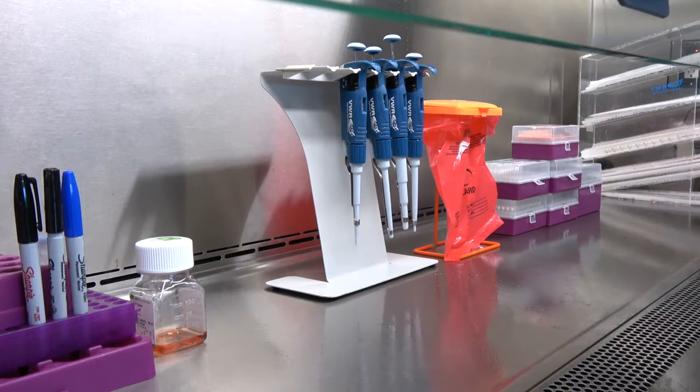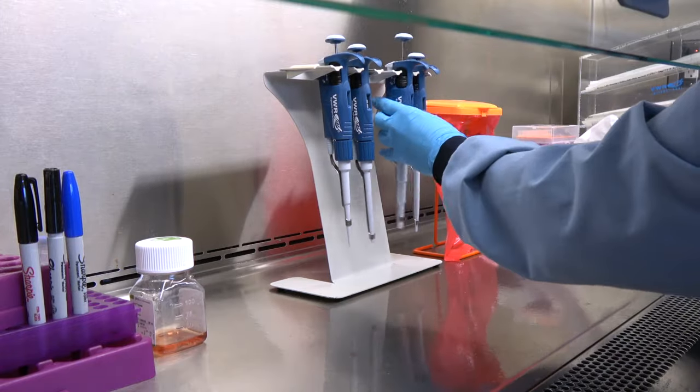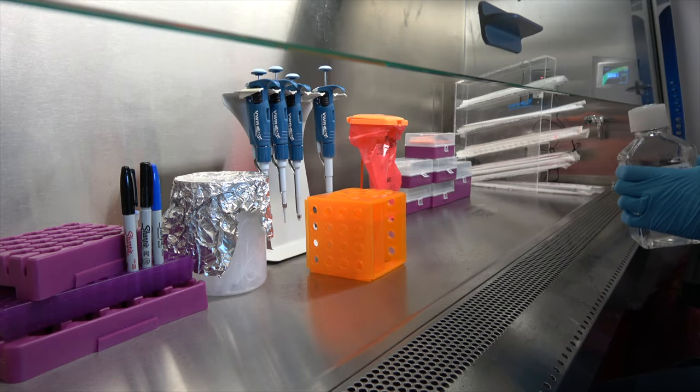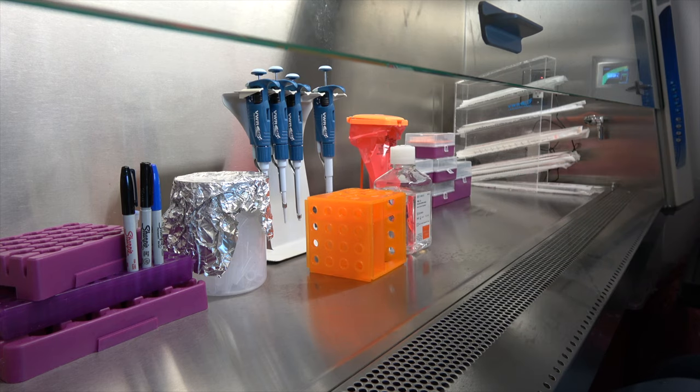Once the unit has warmed up, wipe all pipettes and surfaces with 70% alcohol and allow it to evaporate. When working in a biosafety cabinet, you should minimize the number of times you enter or leave the unit, as rapid motions will disrupt the airflow. Thoroughly decontaminate all reagent bottles and bags of plasticware with alcohol before transferring to the biosafety cabinet.